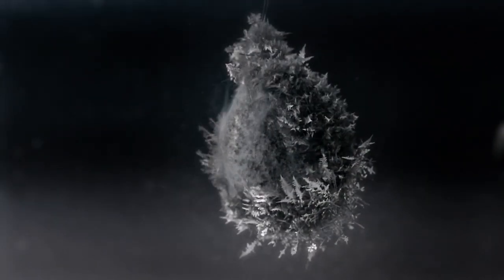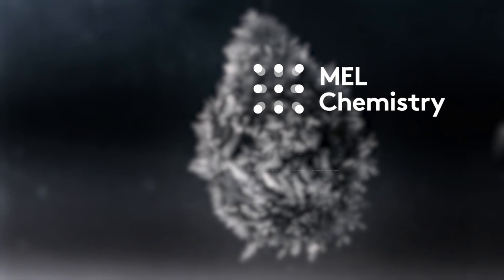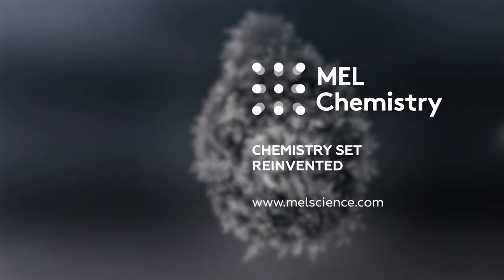You can use a macro lens to take a detailed photo of the hedgehog. Learn more about this experiment on our MELScience website.